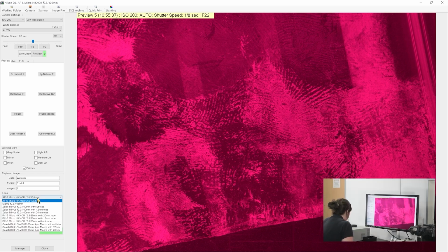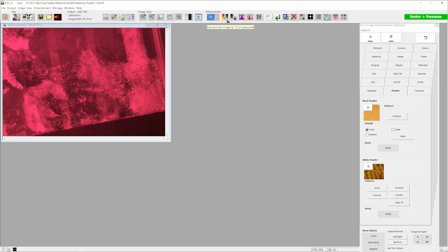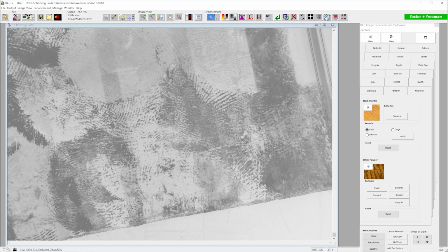If I now just change the lens that I'm using in the software and capture that image through to the enhancement screen, we can do a couple of really nice and simple enhancements to this image. The first thing I am going to do is convert this image to grayscale. If we look at this area of ridge detail here, primarily, and this one here as well, this is quite a tricky one actually, because this area of ridge detail that we see here is actually already dark, whereas this area here, which is the part I'm going to concentrate on, we can see a couple of pores throughout. This area would need to be inverted to give us nice dark ridges on a lighter background.